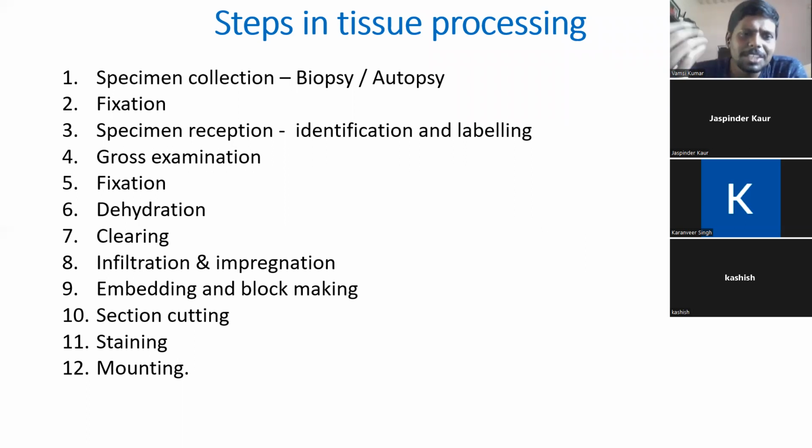Upon getting these tissue sections, we will go for staining. The usual stain we use is H&E staining. After H&E staining, we can also mount it. Mounting means, very simply, laminating the slide, just the way we laminate our certificates or photos with a plastic wrapper so that they won't get damaged by environmental factors. Similarly, we mount the glass slide with DPX, so the tissue will be preserved for a long time, almost 200 to 300 years. Upon mounting, we go for microscopic examination. So these are the classical steps in histopathology.